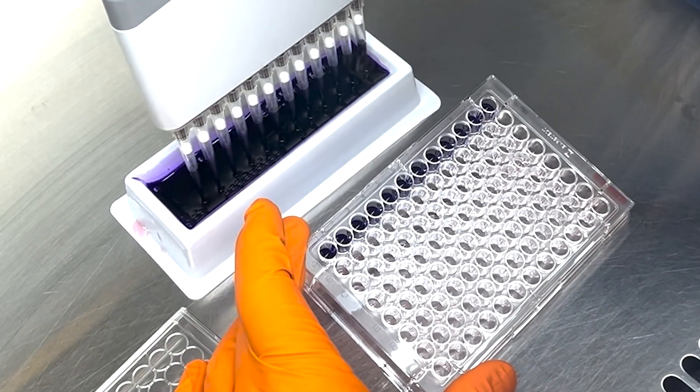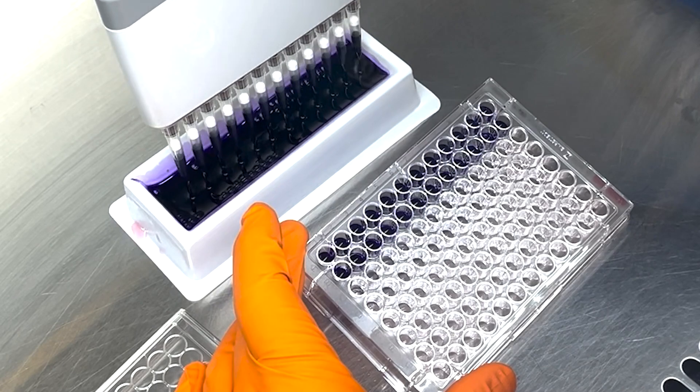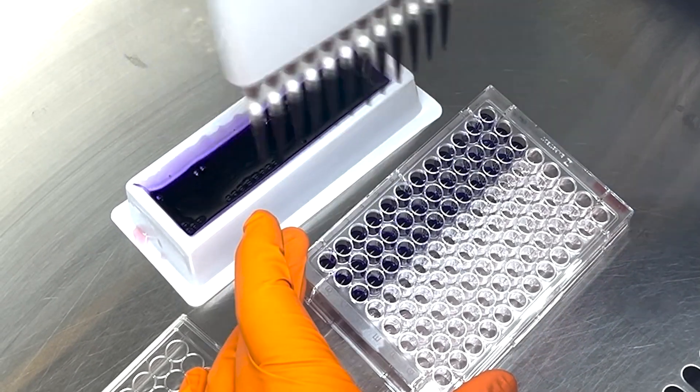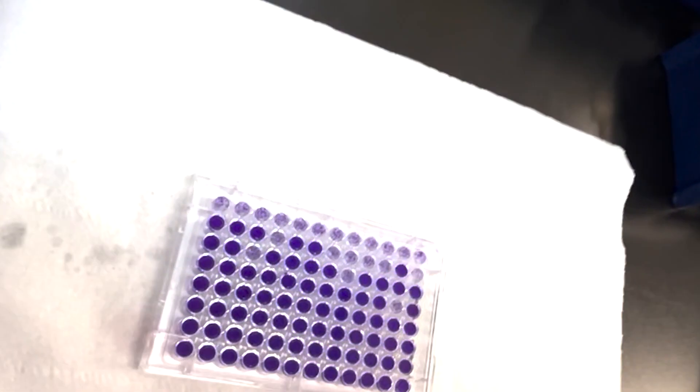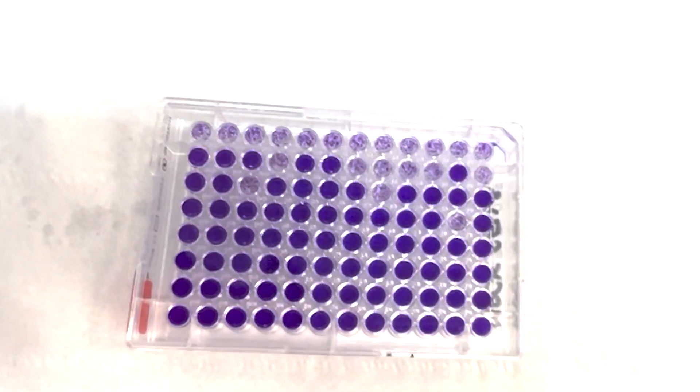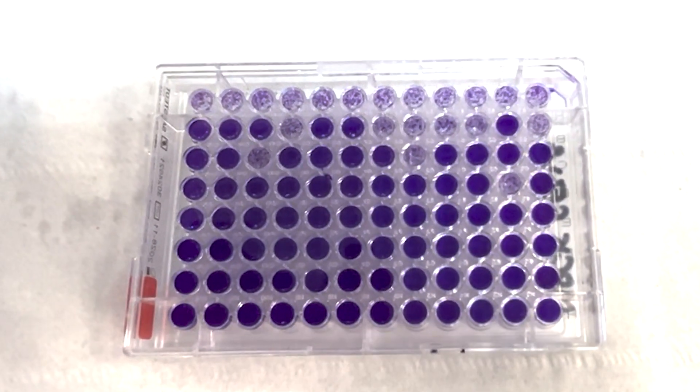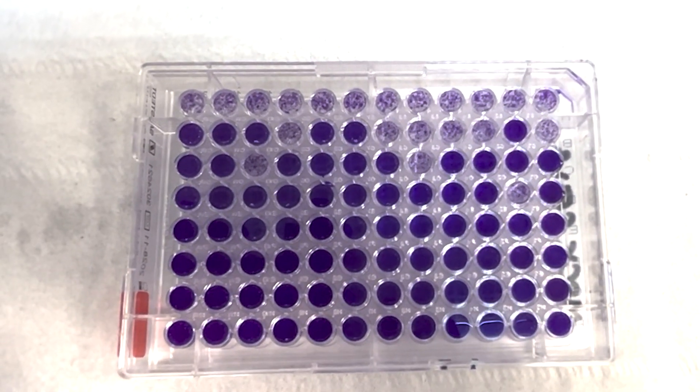This dye penetrates and colors the cells in the wells, highlighting their presence distinctly. The wells that appear light or clear indicate where the cells have succumbed to the virus. These are the wells we count as infected. It's a clear visual guide to understanding the extent of the infection.